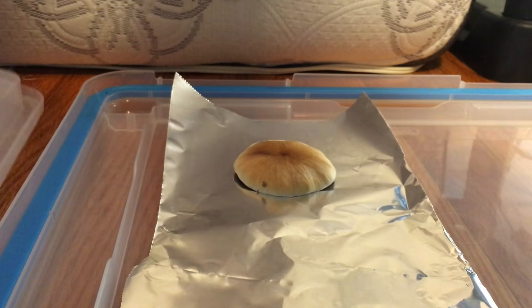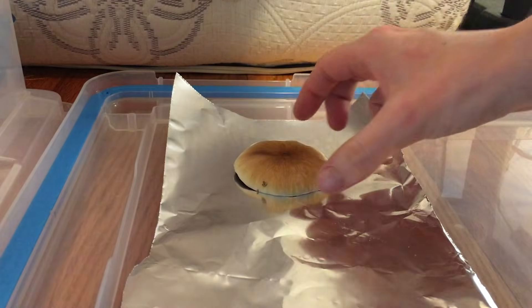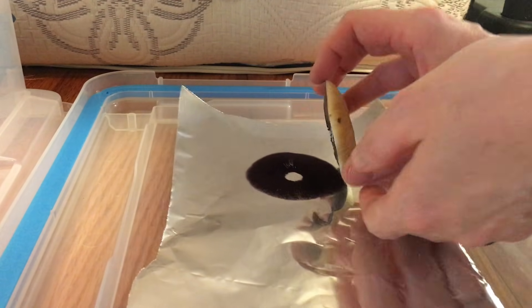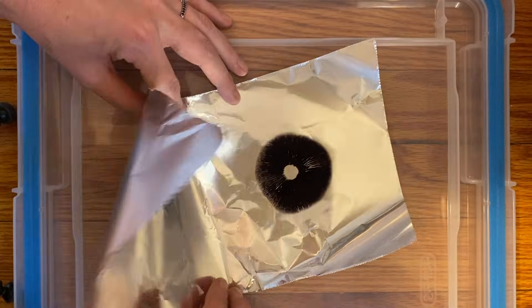After 24 hours, your spores should have fallen and you'll have yourself a spore print. Next, remove the mushroom cap from the aluminum foil, then carefully seal up your spore print for later use.